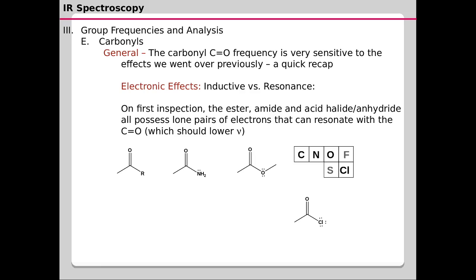Okay, and as far as the alkyl substituted carbonyl compound is concerned, the alkyl group, as you know, is an inductive electron donor, which can donate electron density towards the carbonyl carbon through a plus I effect mechanism. That can influence the electron density around the carbonyl carbon, because as you can see, when the electron density is pulled more towards the carbonyl carbon, that can make the carbon oxygen sigma bond stronger.